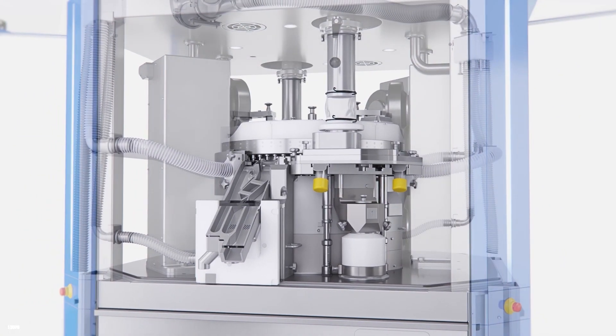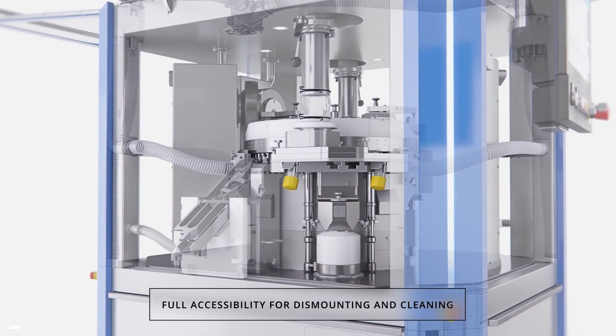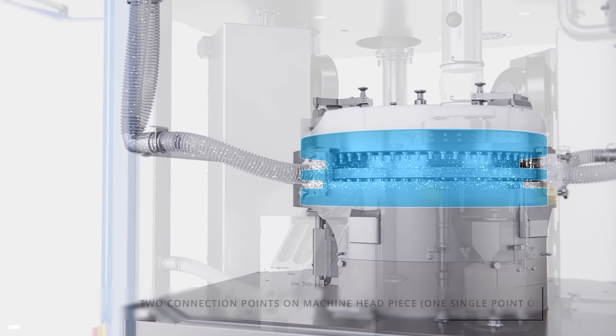The new concept for routing dust extraction hoses through the multi-function channels permits full accessibility for dismounting and cleaning. As a result, the machine base is free of hoses and therefore not contaminated.